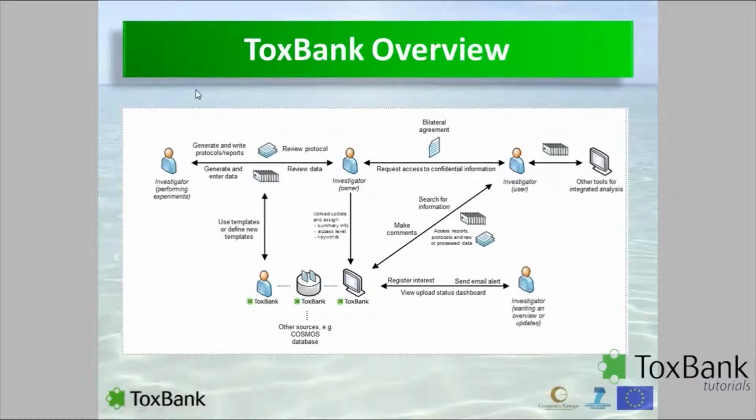Throughout the SEURAT-1 cluster, investigators are generating data, and they are creating protocols and standard operating procedures. It's the role of the warehouse to house all this information in a centralized repository. Once a protocol has been reviewed, it can be uploaded into the warehouse. In the same way, data can also be uploaded. But the preferred way to organize the information is with standard templates, and we are using the ISA-TAB Universal Data Exchange format to consistently represent investigations.